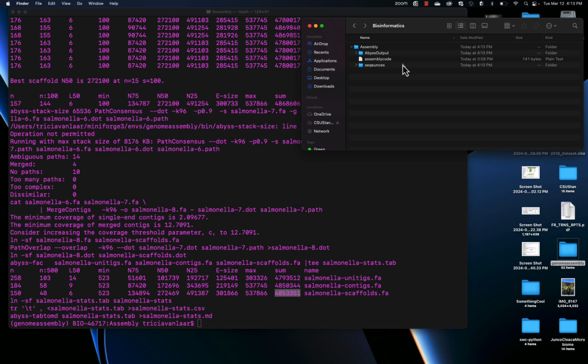And so that's how, either on the Windows or on the Mac, you should get your results from ABySS. Okay. So I'll create more videos to help you along with the rest of the stuff that we're doing.